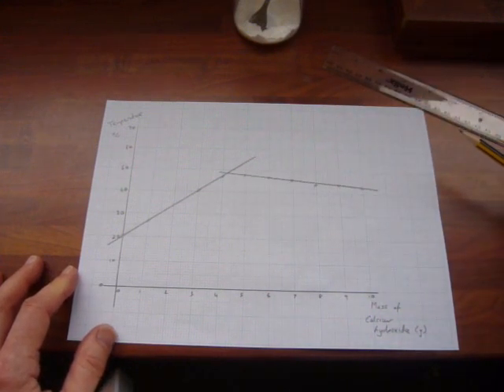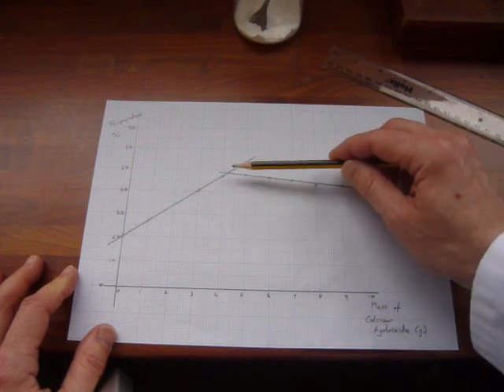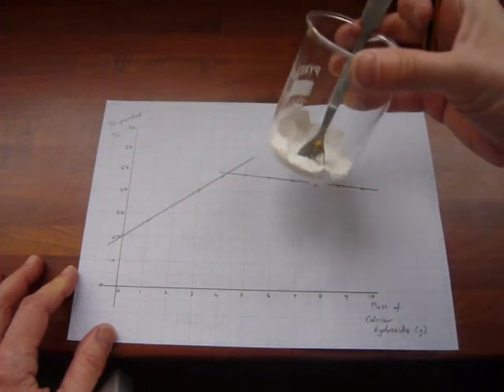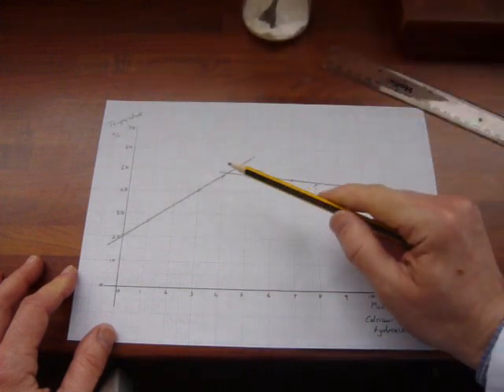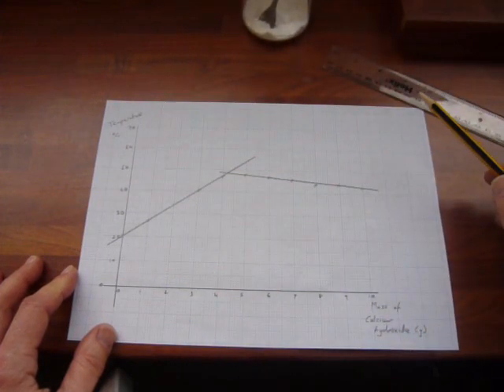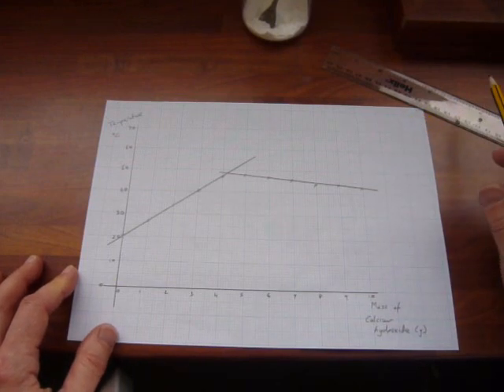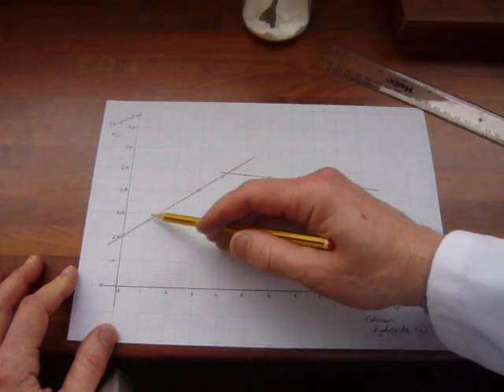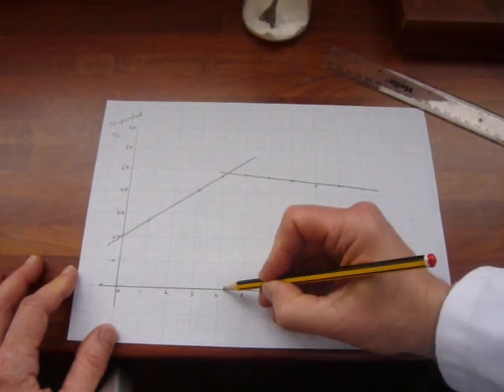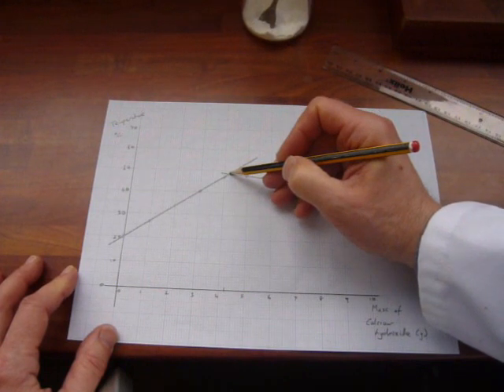And it's because once you've added a certain amount of calcium hydroxide, that was the white solid in this case, it has reacted with all the hydrochloric acid. And we can work out from our graph exactly how much calcium hydroxide reacted, because where the two straight lines meet, it's about 4.2 grams, is where the maximum amount of reaction took place.